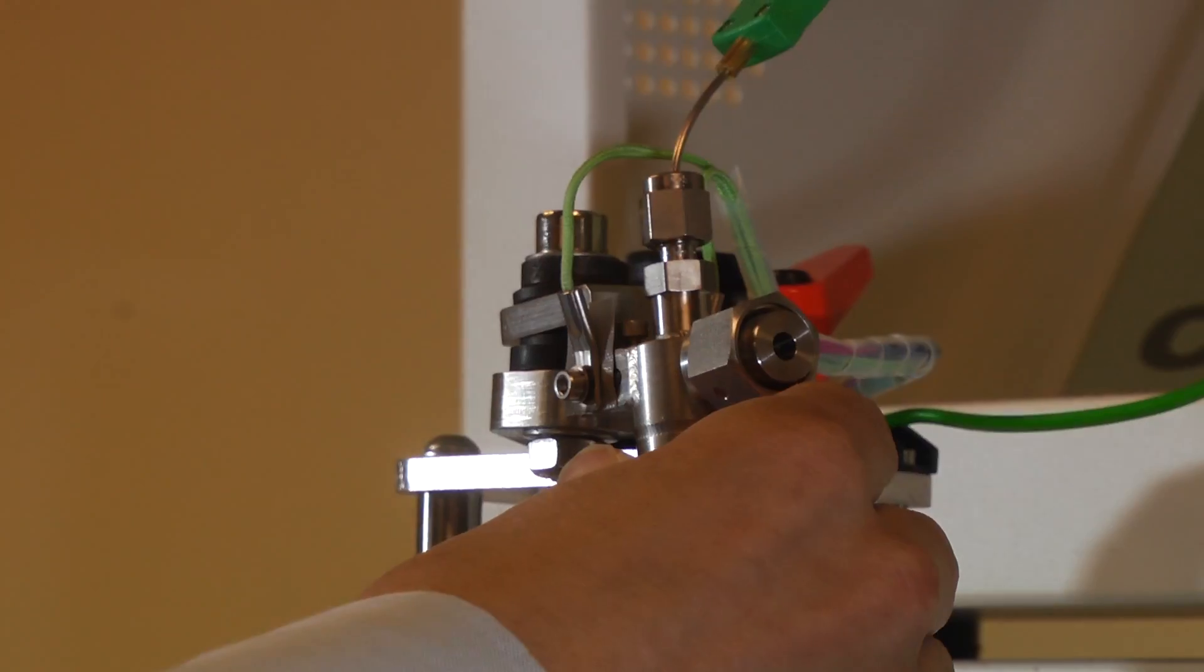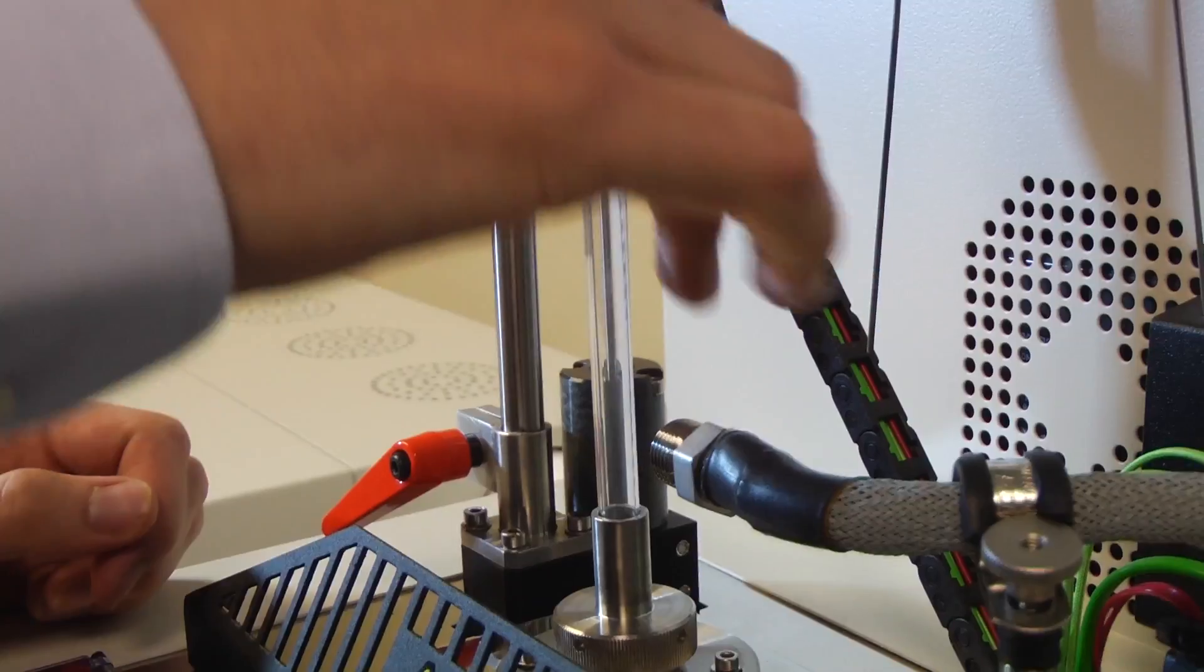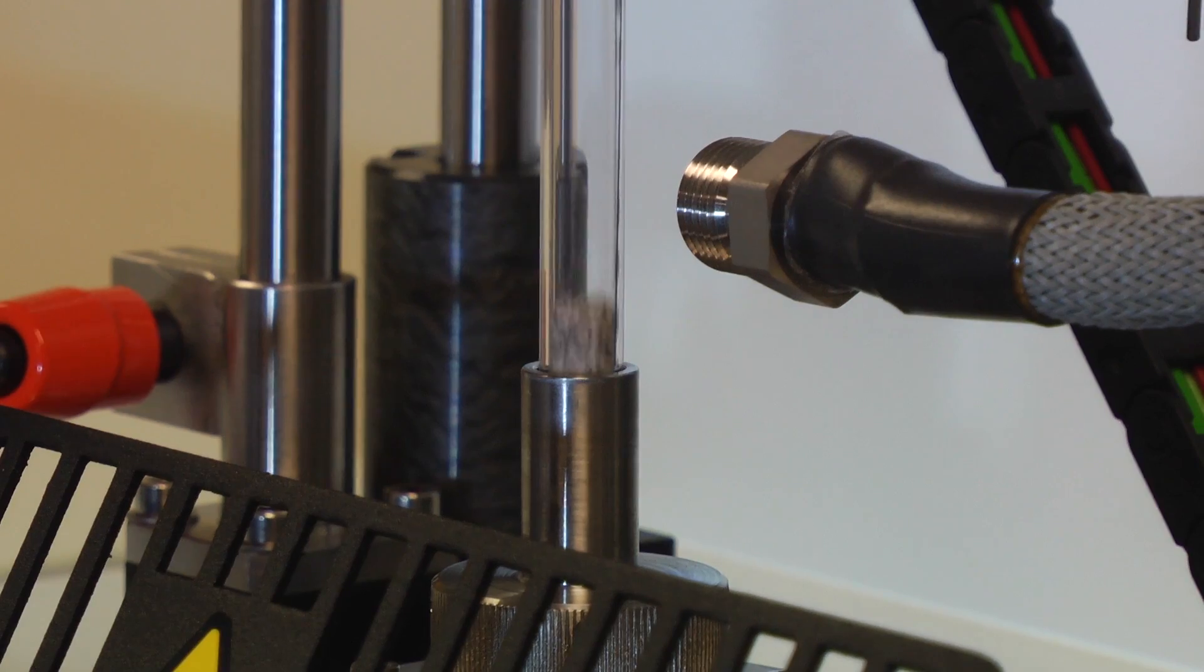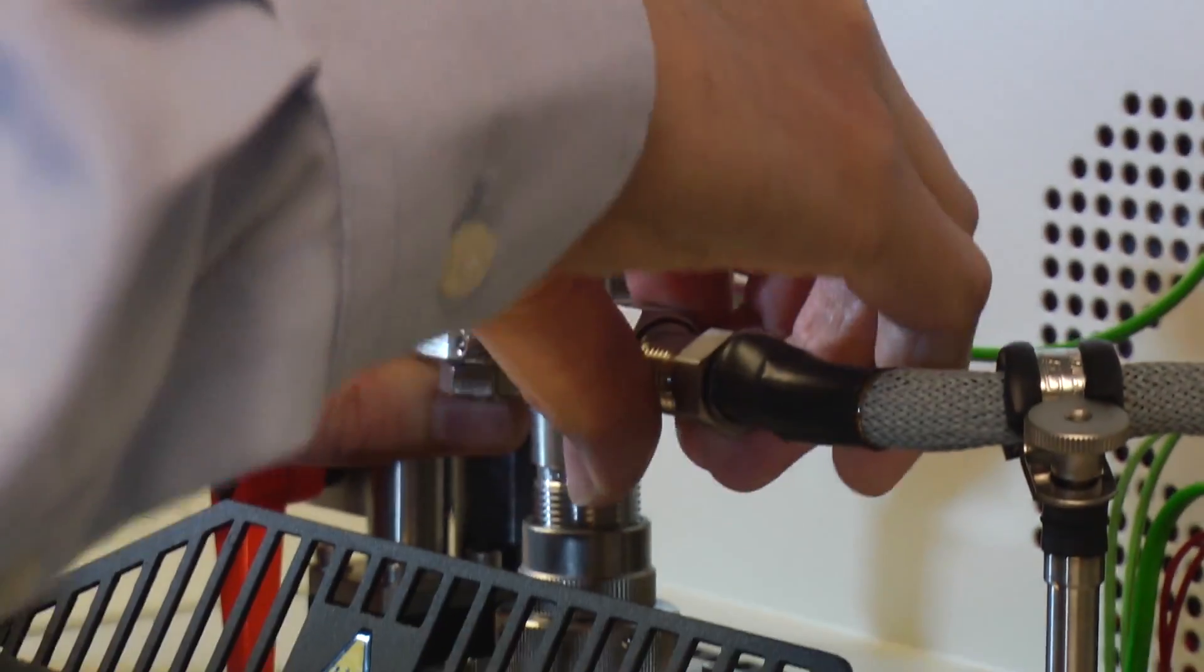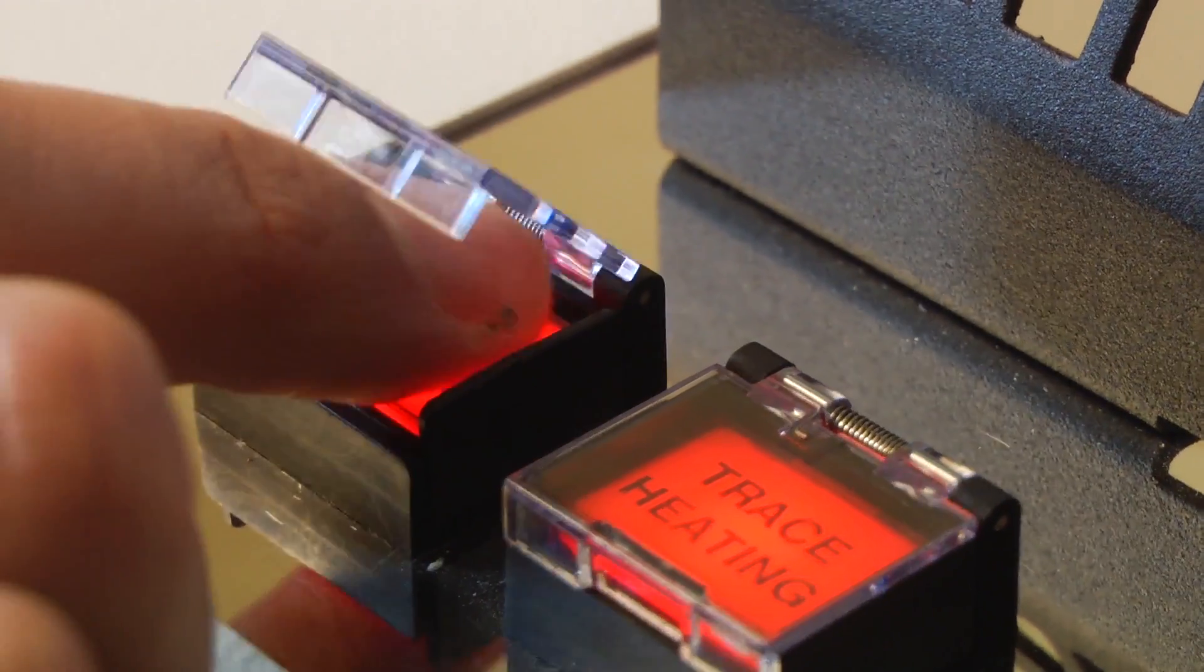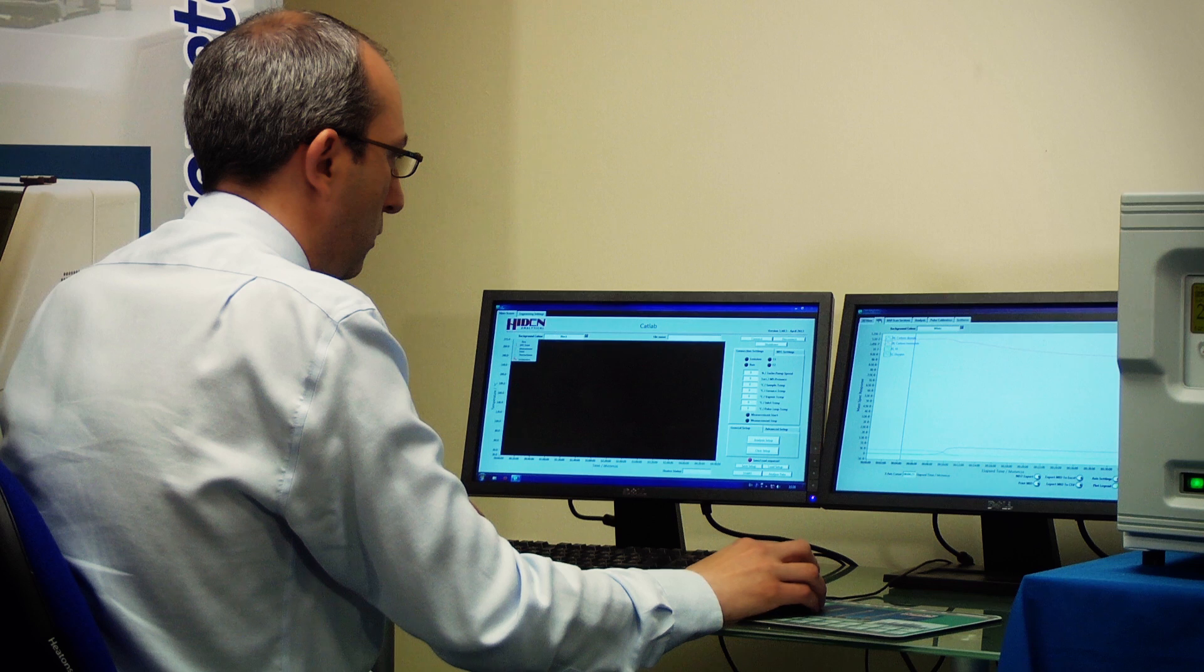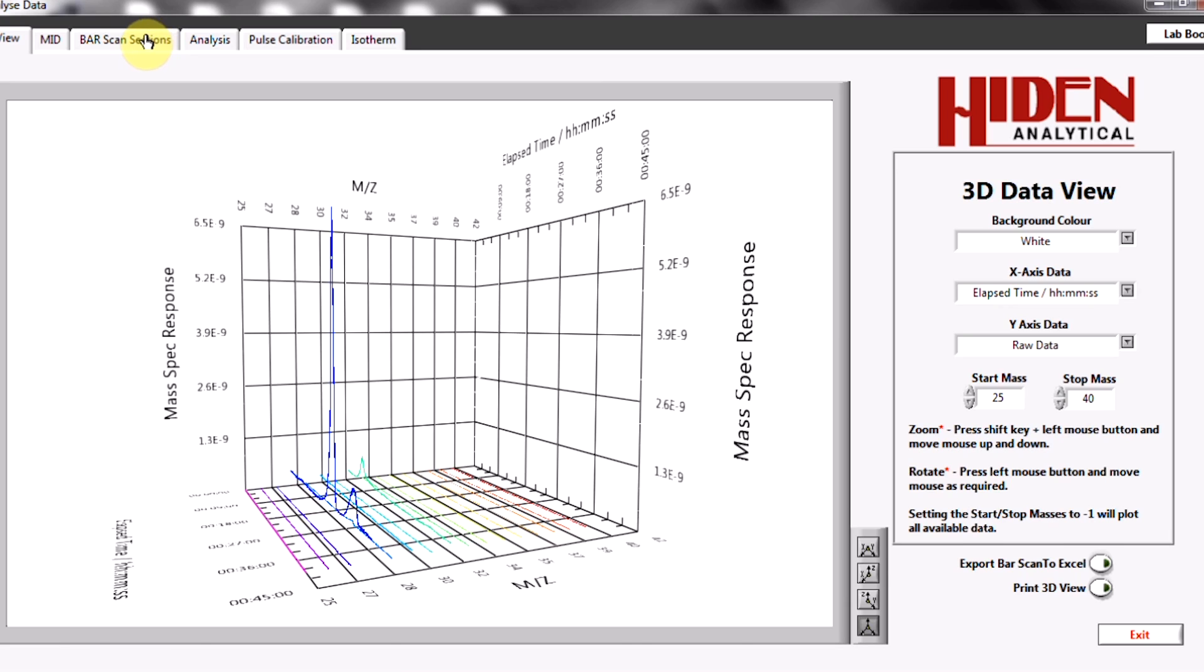The sample is loaded on top of a quartz wool plug in the novel catalyst cartridge system. The catalyst cartridge is then loaded into the furnace. The sample thermocouple is then lowered into the catalyst cartridge and the inlet manifold resealed. After loading the sample, the experimental template file is selected and the experiment started. The system will then run unattended while the automated measurement is performed.